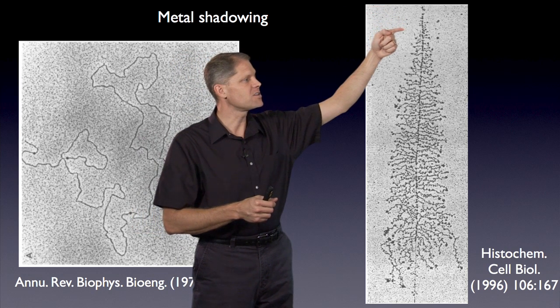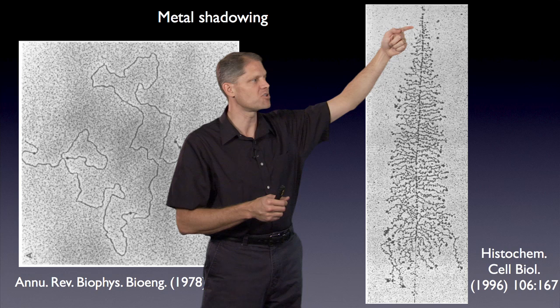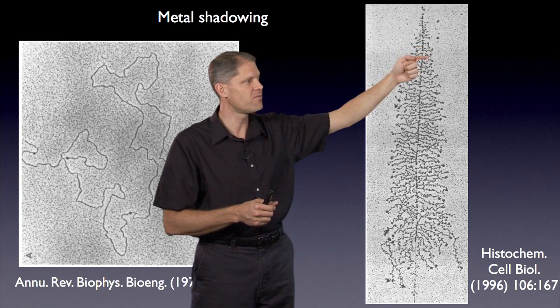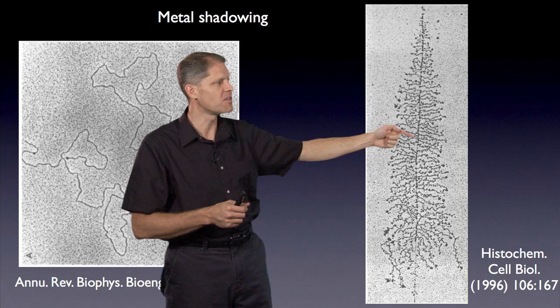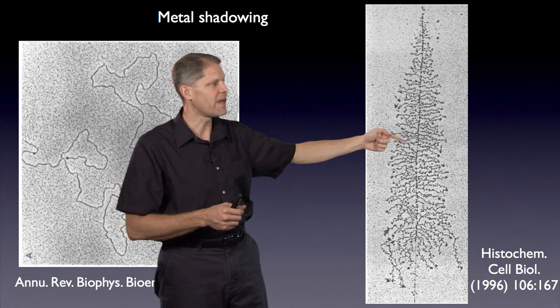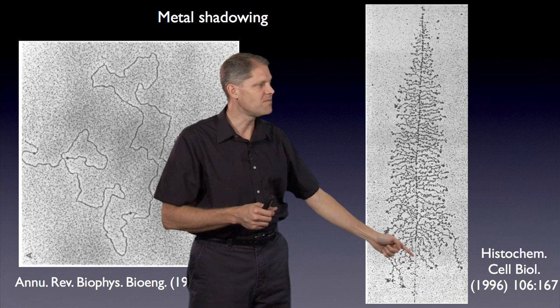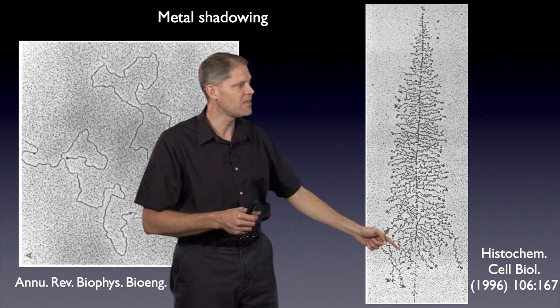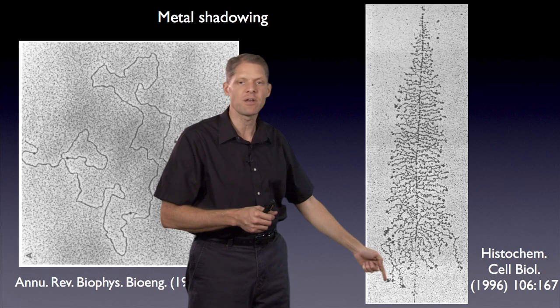And here at the top, these RNA polymerases have just started, and so their transcripts are short. And as you go down further and further downstream in the gene, the transcripts get longer and longer, creating like longer limbs to the tree. And eventually, by the end of the gene, the transcripts are very long indeed here, and even some assembly is starting to happen at the bottom of the genes.